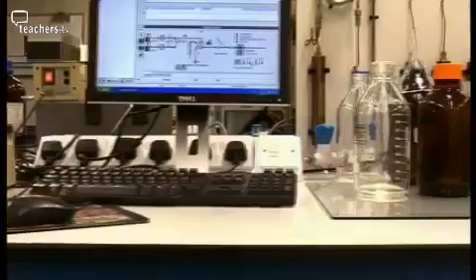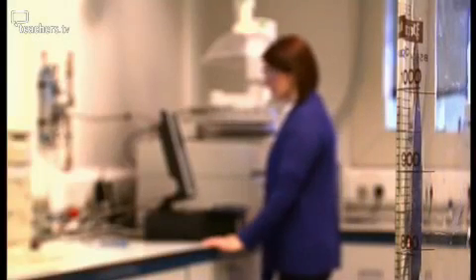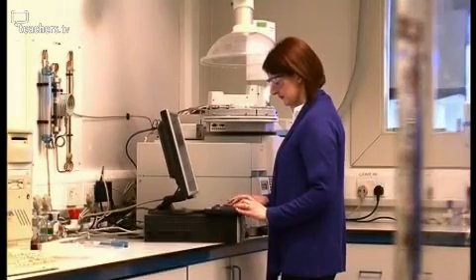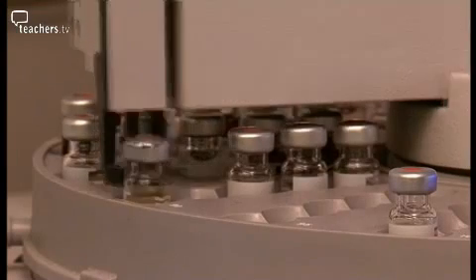Murder investigations depend on forensic science. Forensic science depends on chemistry and biochemistry to uncover the facts. Forensic scientists have numerous techniques up their sleeves to identify blood, clothing fibres, body fluids, and DNA. This machine finds needles in haystacks. It can locate one molecule among millions and turn an alibi into a lie, or confirm the cover-up of a murder.